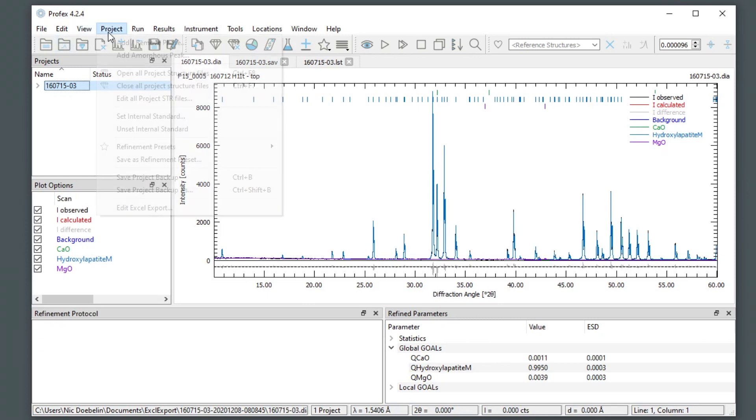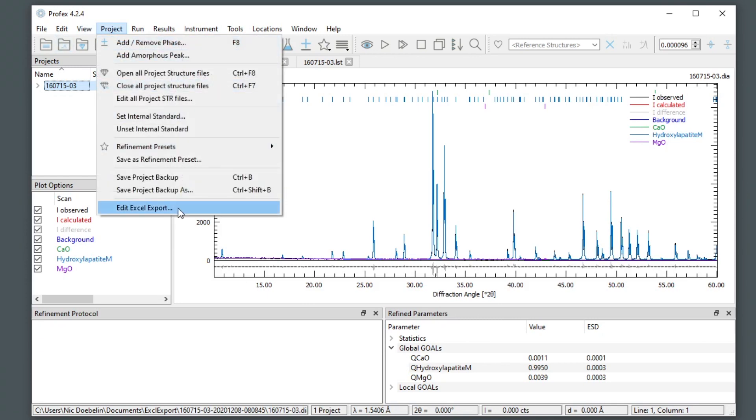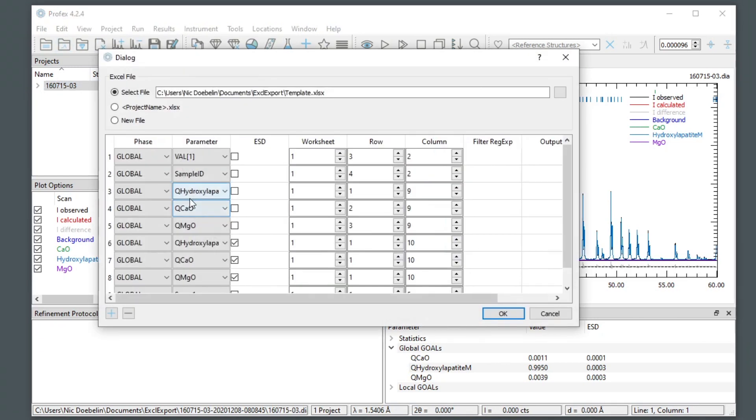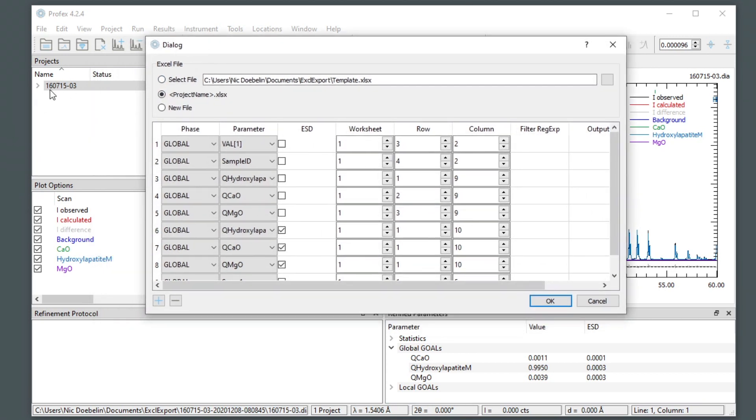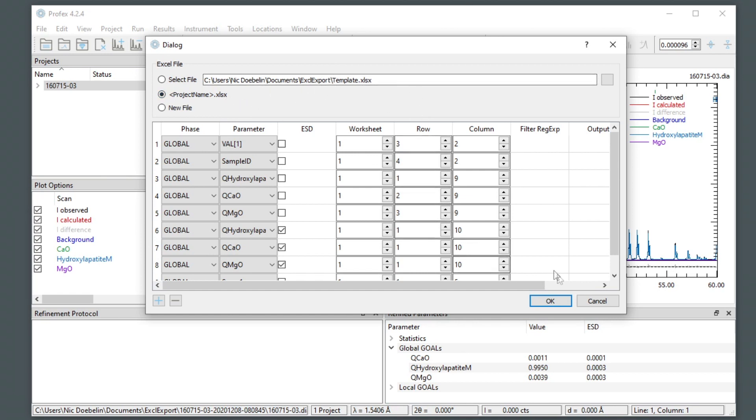In the export configuration, there was also an option to export the results to an Excel file with the same name as the project base name. If we check this, it will search for a file in the project directory with the same name as our project. So in this case, that would be 160715-03.xlsx. And in certain use cases, this is much more convenient than opening the same template for all projects. And I want to show you an example when this might be the preferred option here.